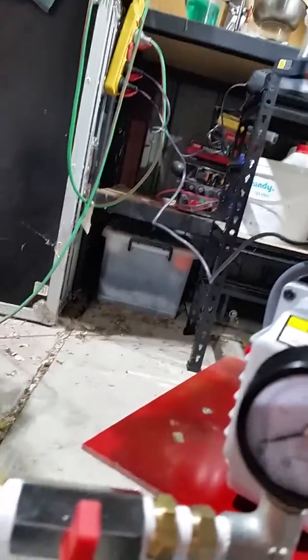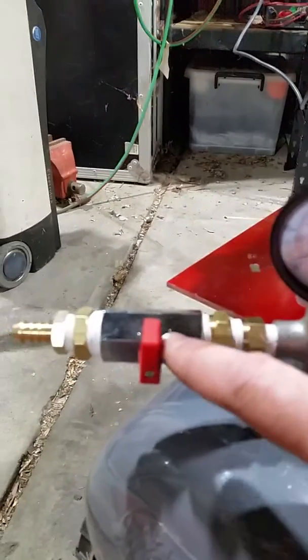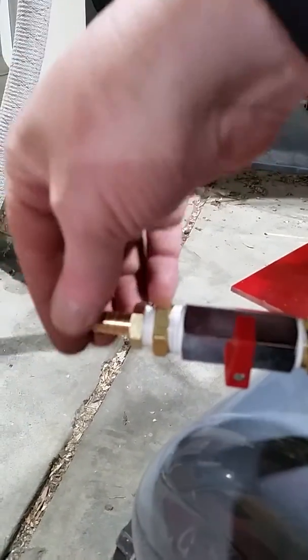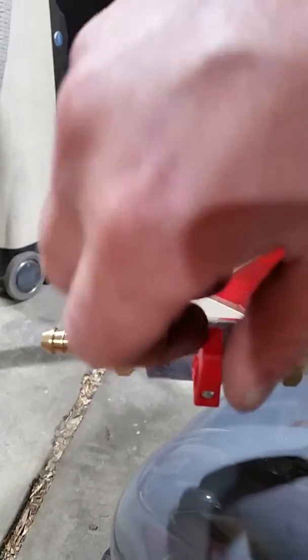It's pretty good. And I've got the valve, so it comes up from the main tank here, up, tee off the gauge, and then through a ball valve here to a hose barb, which will go off to the flask or whatever that I'm vacuuming.